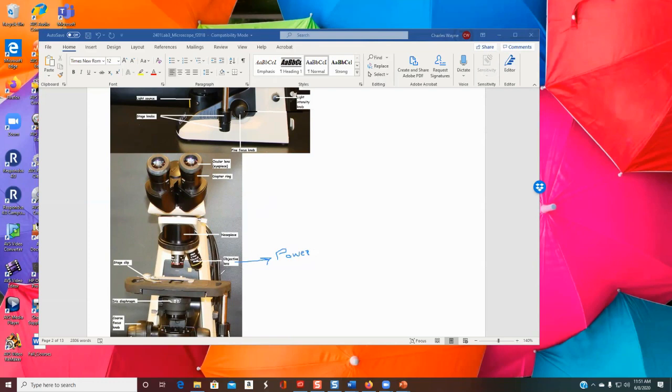Now I can tell from looking at this, because I know the microscope, that this should be the 40x lens. So I'll just write that out here. When you use a microscope, all you have to do is look at the objective lens. There may be 3 or 4 of them. If they have an oil lens, they have 4. You just look at the lens and read right off the objective lens what's there. Now, I'm hoping I picked that right. If not, it doesn't matter because you'll obviously write down what you see. Also, there will be something else there.